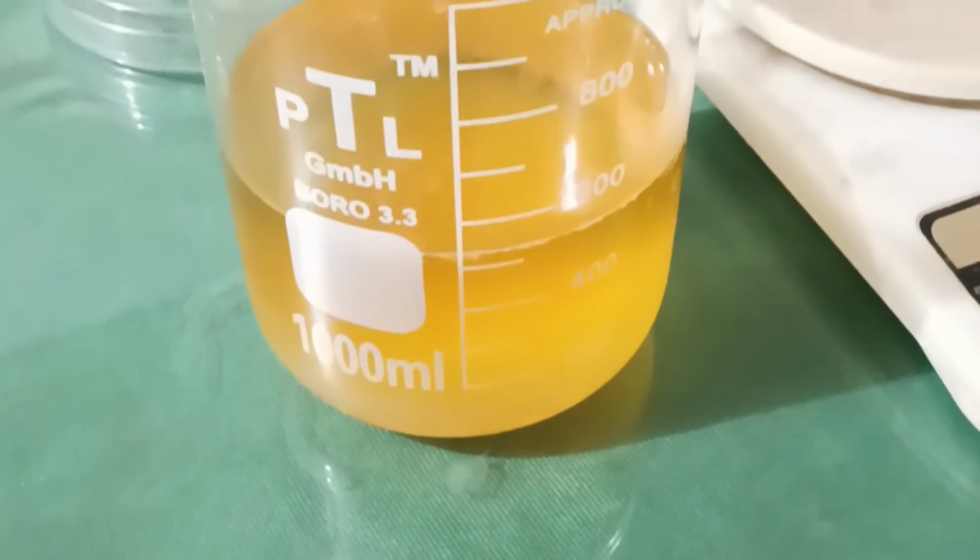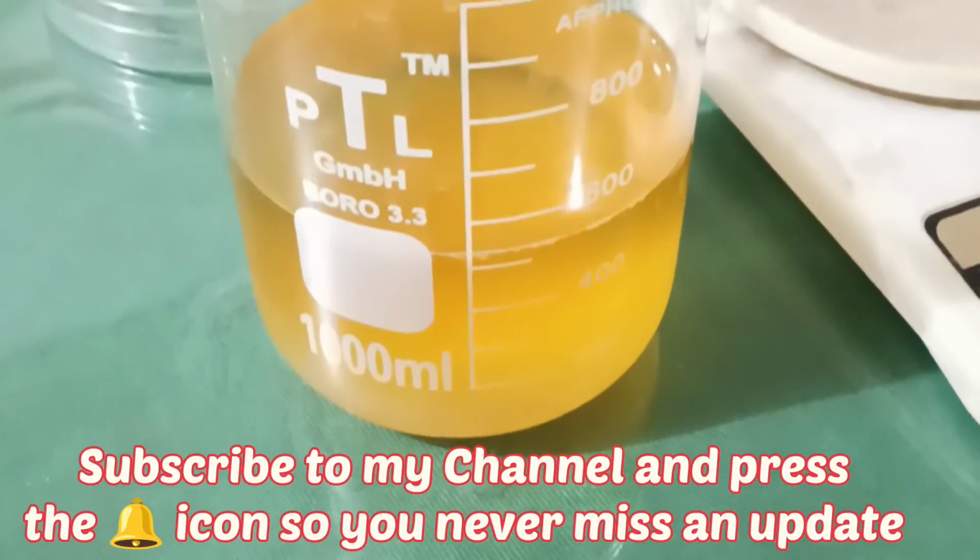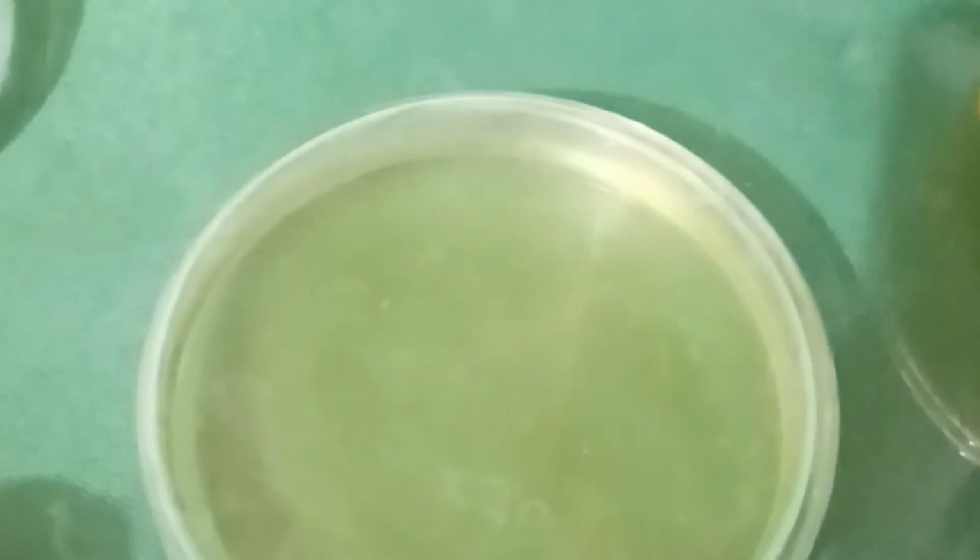After boiling, it was autoclaved at 121 degrees centigrade and 15 pounds of pressure. After autoclaving, we will pour the media into the petri dishes. After pouring the media into the petri dishes, these petri dishes will be allowed to cool, and after cooling, they will be incubated.